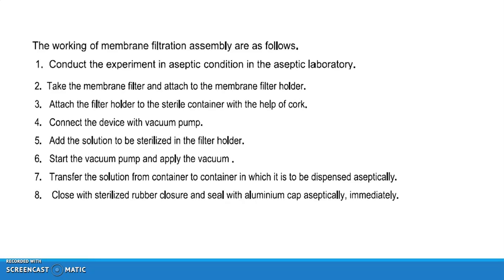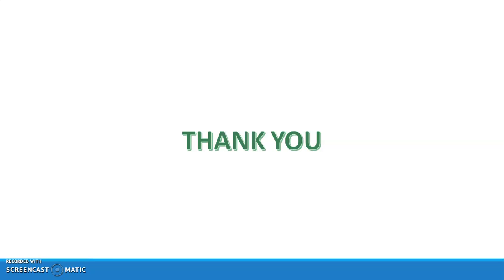After the solution passes from container to container, transfer the solution to the container in which it is to be dispensed, aseptically. Close the sterilized rubber closure and seal the aluminum cap aseptically immediately. So this is how the membrane filtration assembly works, and all the sterilization chambers work.